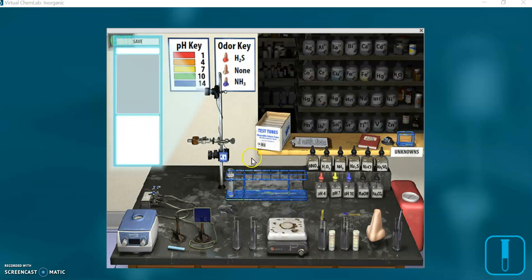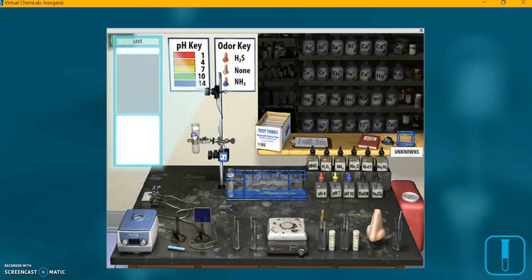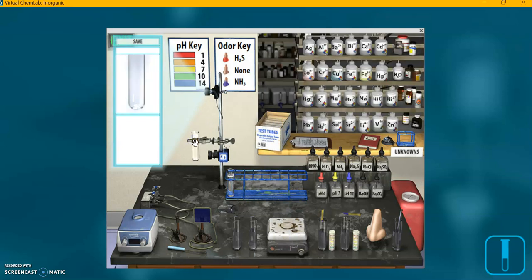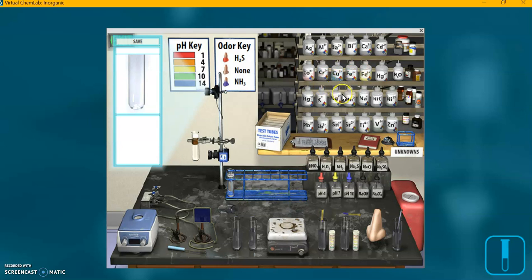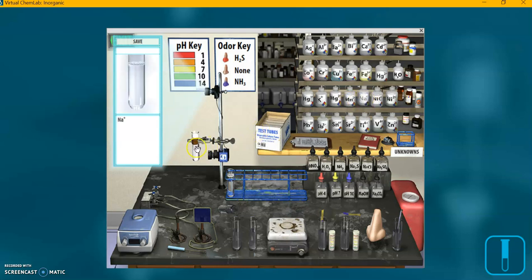Now as it says on step three of the Beyond Labs sheet, I'm going to grab a test tube from our test tube box, click and drag over to our metal test tube stand. When you put something in there in the metal test tube stand, that's when it activates all the bottles over here so we can put stuff in it. And all I have to do, to click on the sodium bottle and check it out. It just immediately fills this test tube up in our stand with sodium. You can see in the zoom blow up window here, it's got sodium in there.